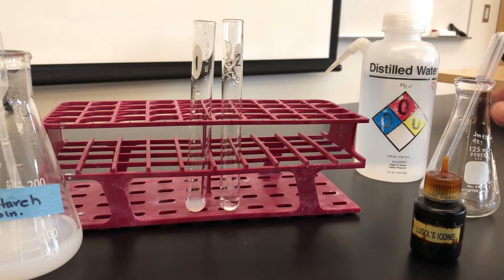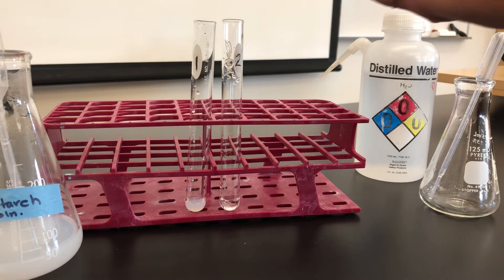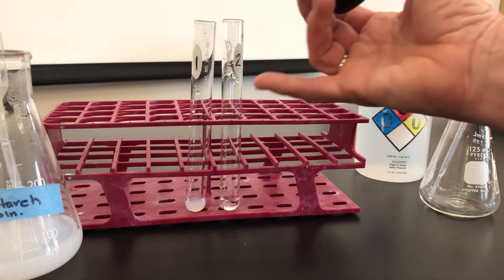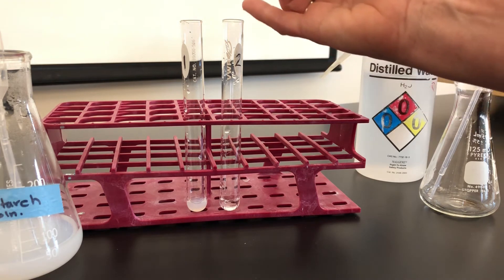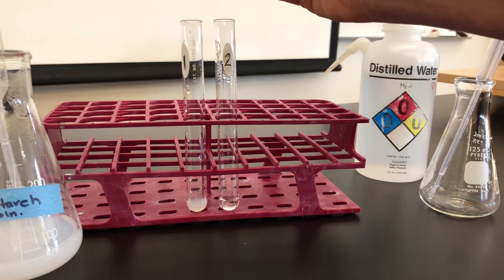According to the directions, we then place 3 to 4 drops of iodine reagent and note the color. Now to begin with, can you see that the starch is a little whitish cloudy? That's partly because it's starch in a solution and the other is plain water. So now we'll add our 3 or 4 drops.